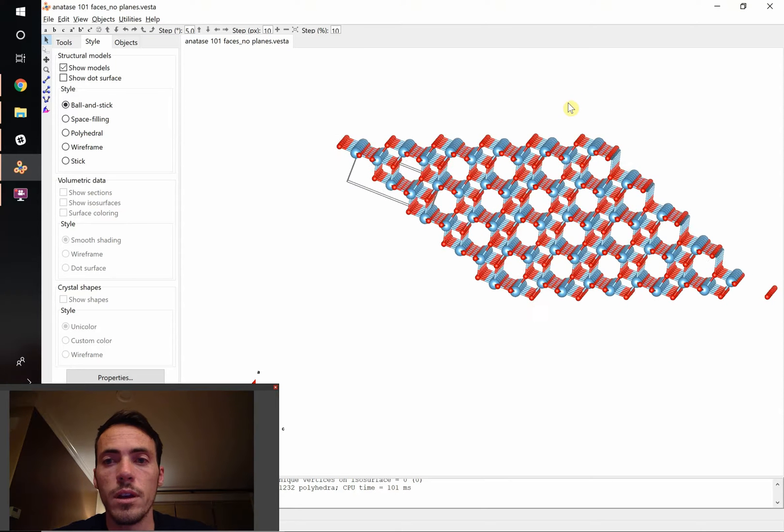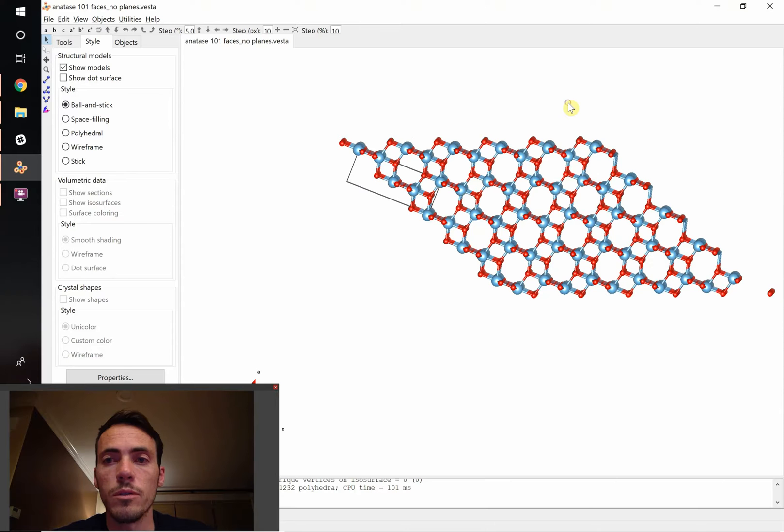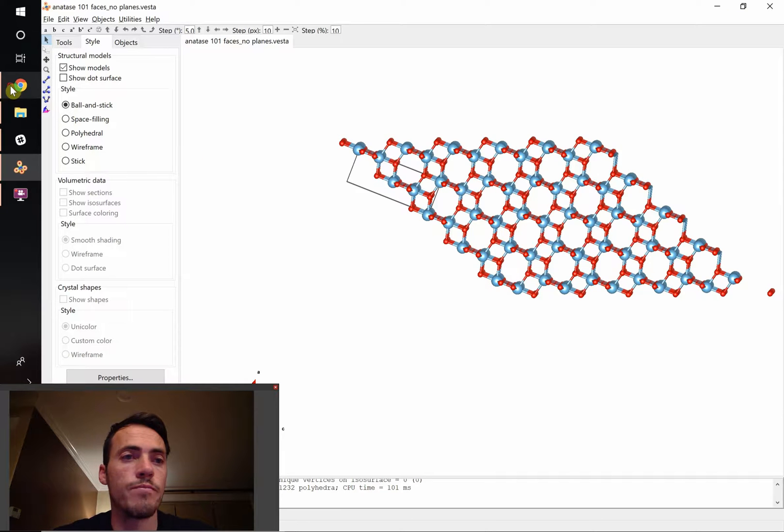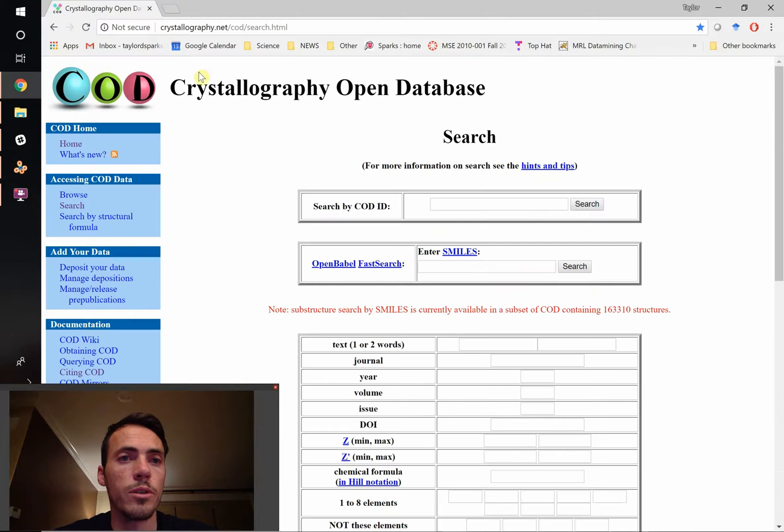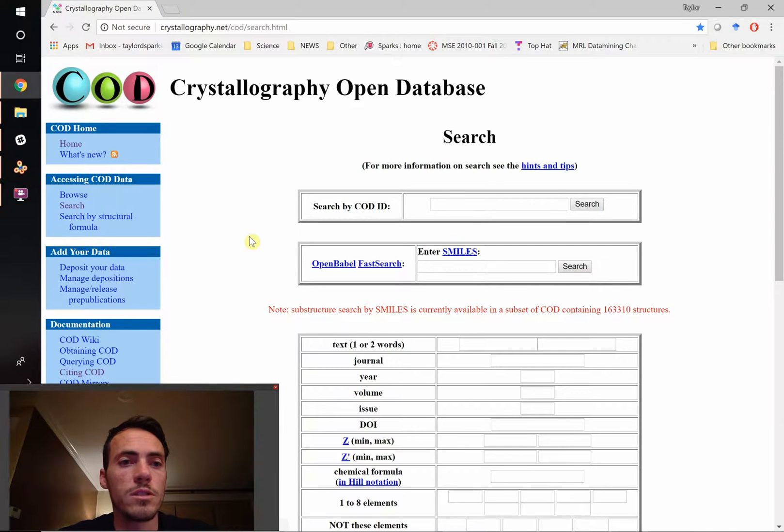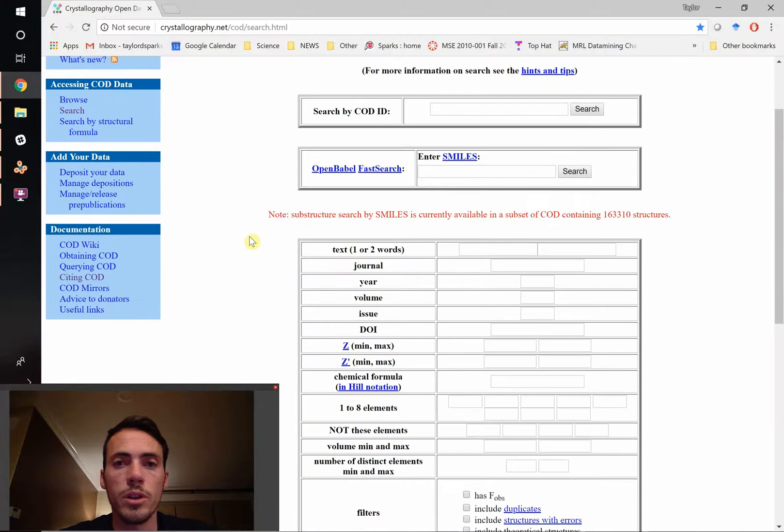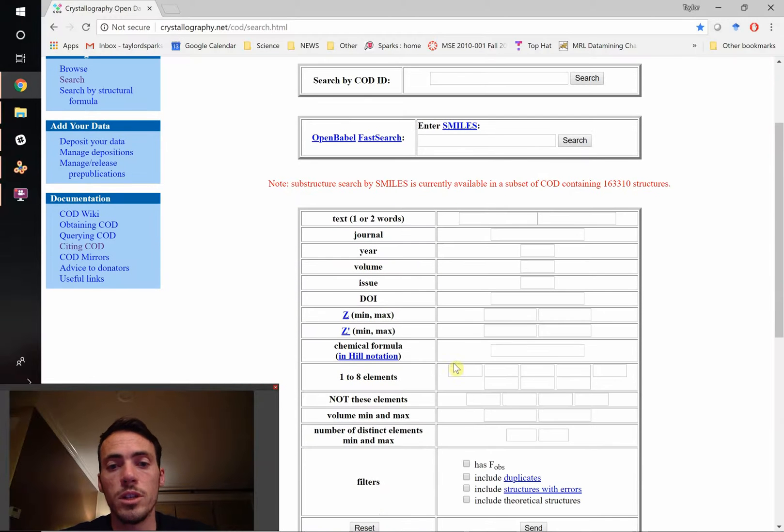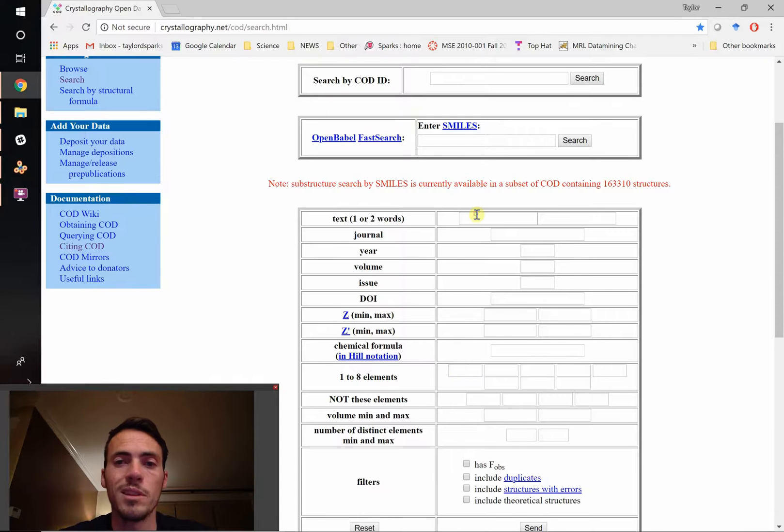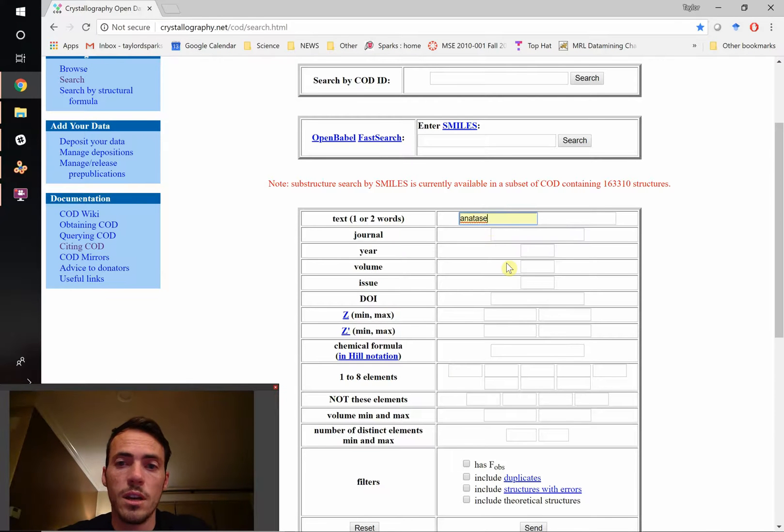Let's get started looking for the crystal structure of anatase. We're going to go to our old friend, the crystallography open database. You're going to hit search, which will bring you to this database, and you could punch in the elements TiO2 or with a name like anatase. Let's just punch it in and see what comes up.